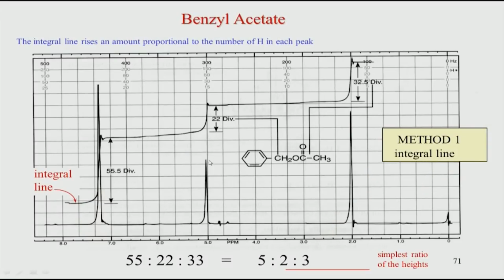This is shown in this particular diagram here. This is taken from a book called Spectroscopy by Pavia. Here you can see a peak for this particular molecule. We will look more closely at why the peaks are coming here and so on under the chemical shift analysis, but in this slide the point to take home is the number of protons. Here it is 3, here it is 0, there are no protons, so of course you do not get any peak from this in the proton spectrum. There are 2 hydrogens here, 3 hydrogens here, and 5 hydrogens in this aromatic system.